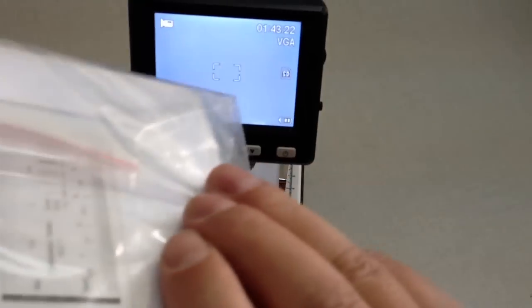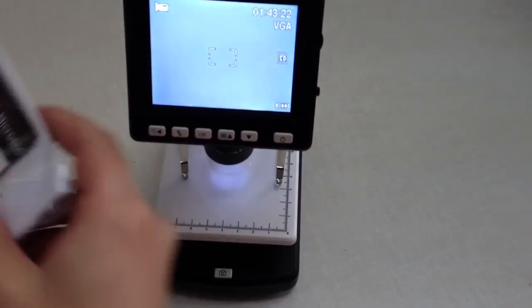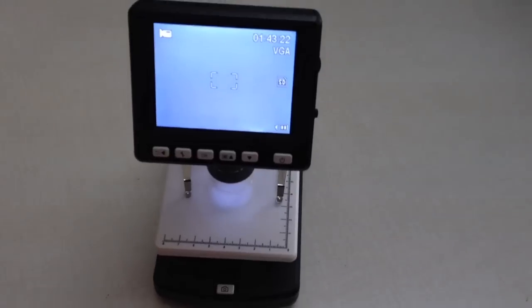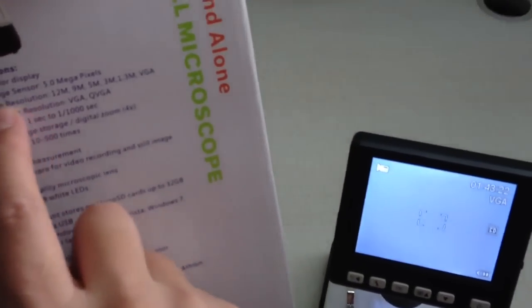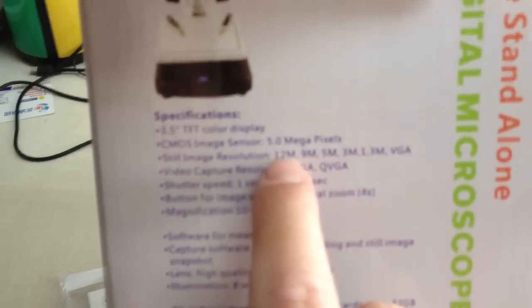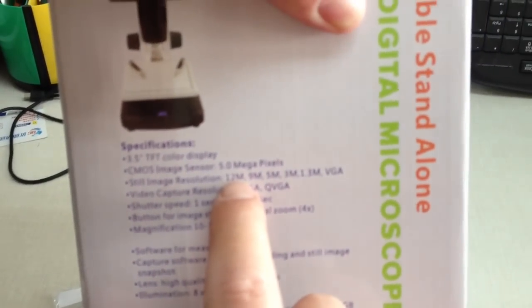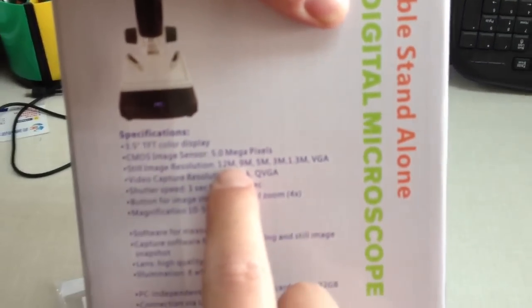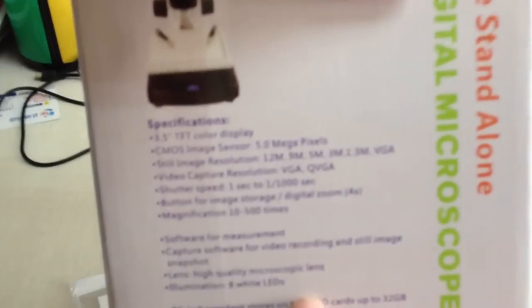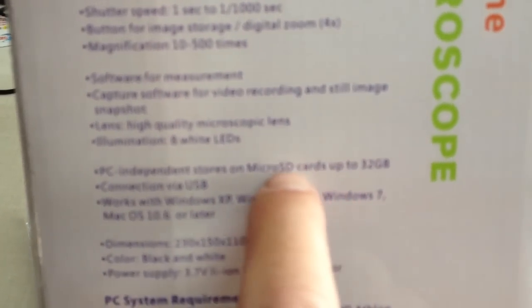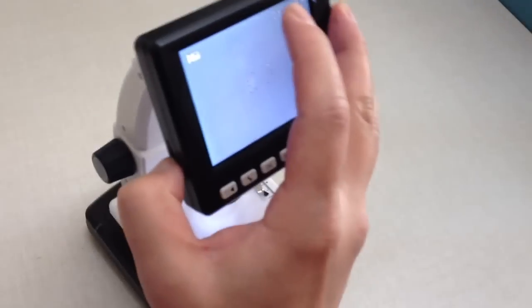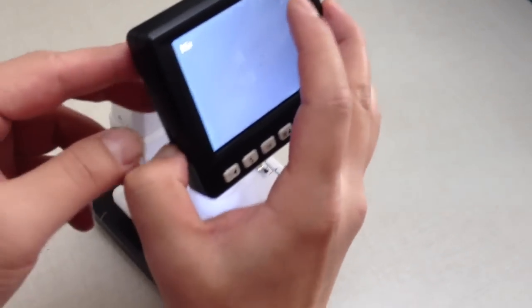The still image resolution is from 1.3 megapixel to 12 megapixel. It supports micro SD card which you can put in and out.